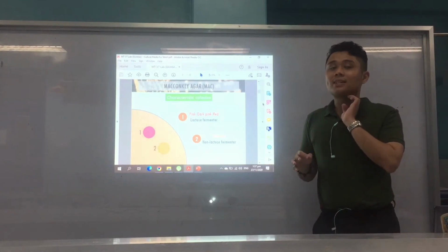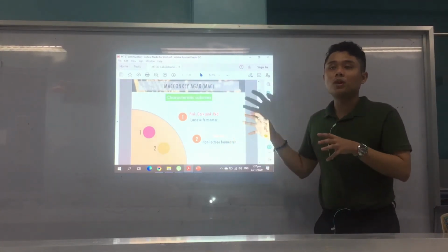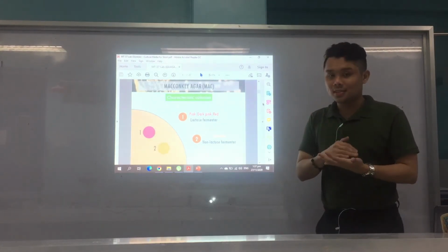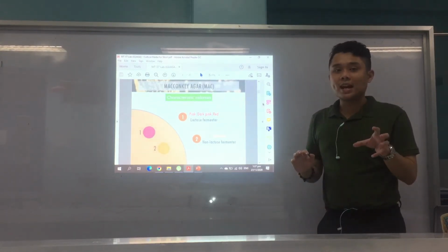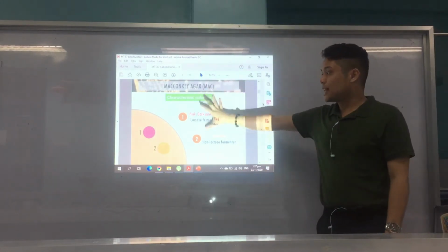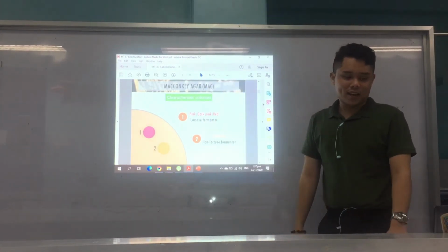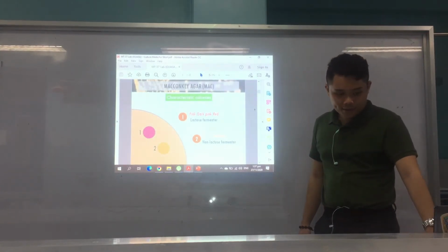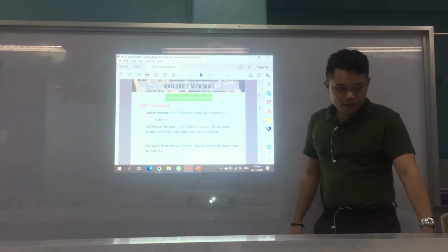Now, again, I have to emphasize, guys, na for this lecture, what you have to take away or what you have to learn are the different components, okay, of the culture medium. Unsay sulod niya, unsay pH indicator, unsay inhibitors, and unsang expected na mga colonies. Okay, please take note. Ayan, muna siya important ani na lecture. Alright, next one we have what we call your, okay.